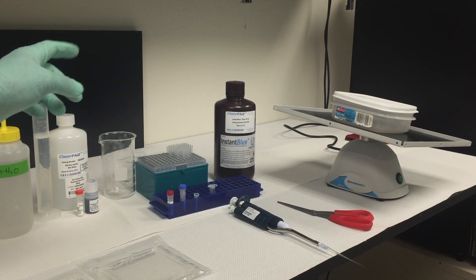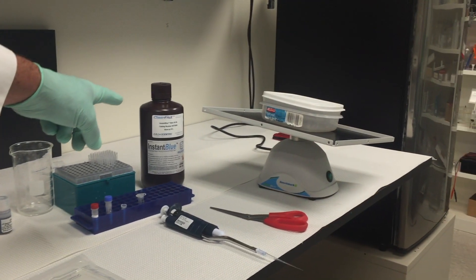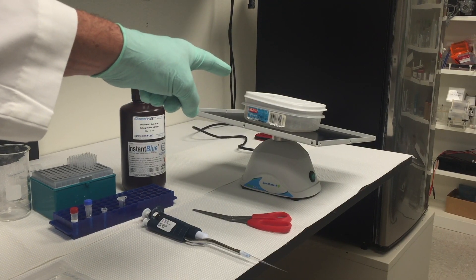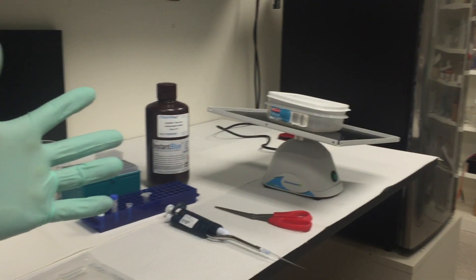For staining you also need Instant Blue stain, a stain container, and a gel rocker. Always wear protective gloves.